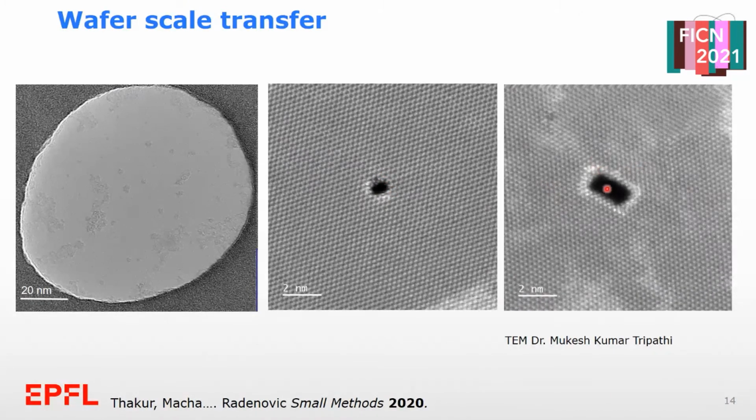So I hope you appreciate the amount of effort that we have to invest just to create small pores. While for people who are working with biological pores, all this happens naturally, and nature has basically perfected the fabrication method in which it can make every single one of these pores identical.